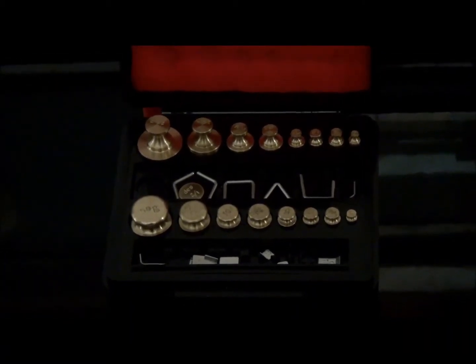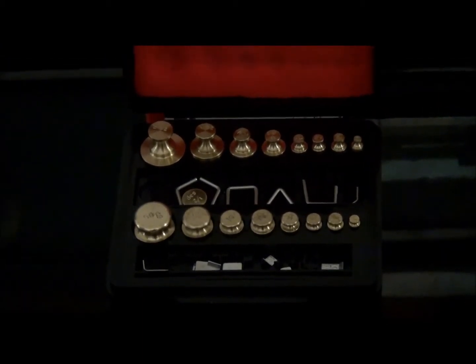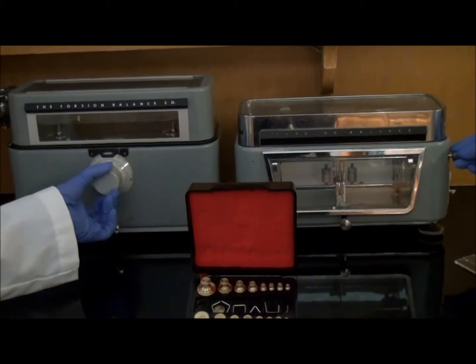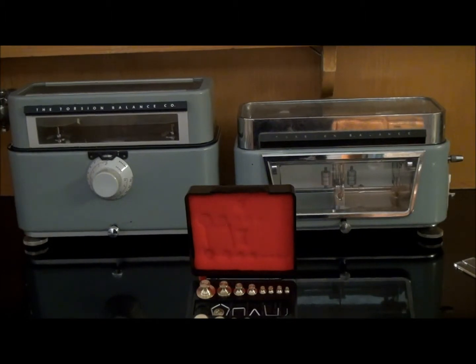Smaller weights are more easily lost and with continual handling may corrode and give inaccurate measurements as a result. It is more convenient to use the graduated beam, which comes as a calibrated dial or a rider, to measure smaller quantities of fractions of a milligram. Instructions for proper handling of weights will be discussed later on in this video.